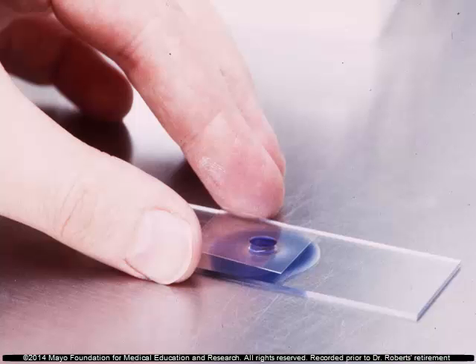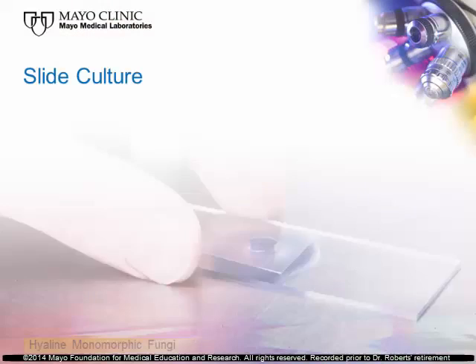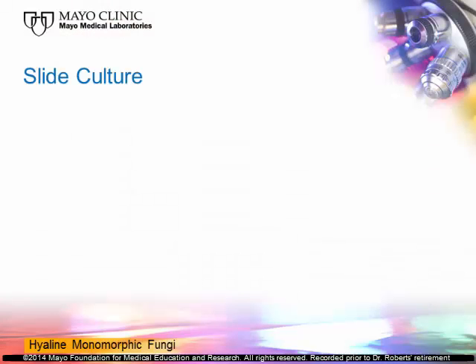The problem with a mount like this is the spores don't stay connected to where they were attached. The pressure that you put down with a pencil eraser or some other object to flatten that out causes them to disassociate from the hyphae or the conidiophore that they're produced on. Probably the Scotch tape prep is the most universal one right now, and the wet mount may be second.